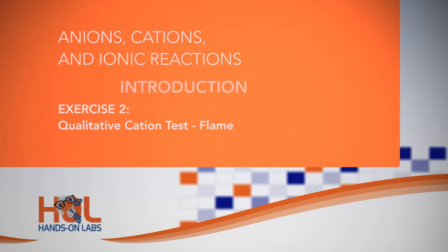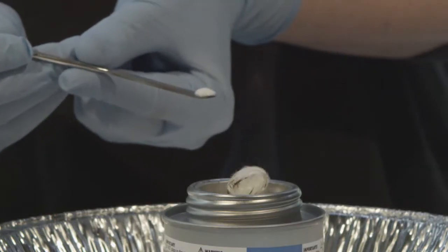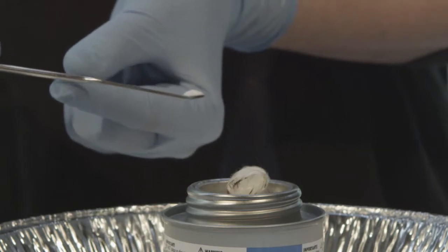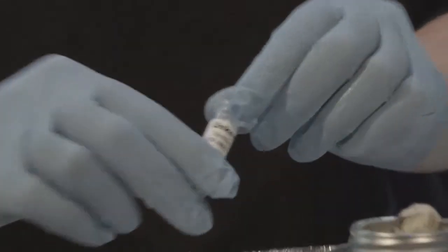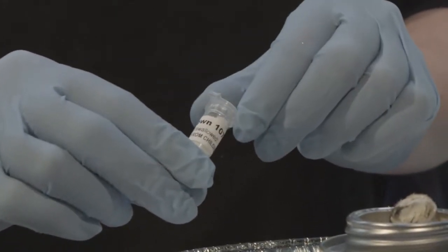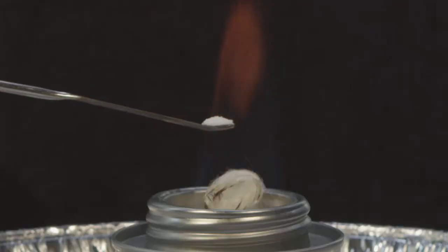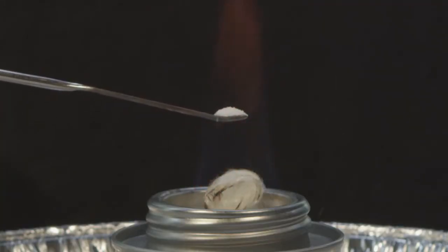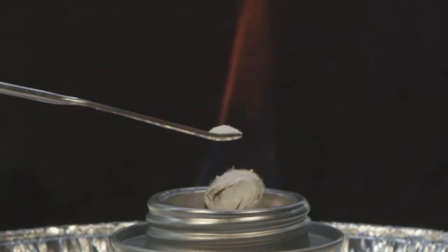In this exercise, you will perform a set of flame tests on chemicals and observe the results of these tests to create a series of cation confirmation tests. You will then use this experience to perform the confirmation flame test to identify the cation of 3 unknown chemicals. Finally, you will use the results of exercise 1 to determine the anion portion of the 3 unknown chemicals.